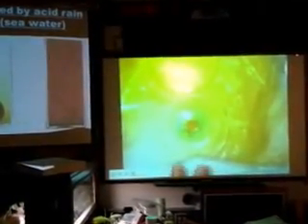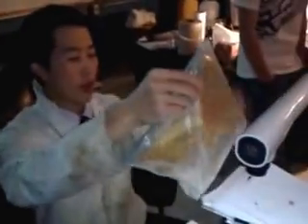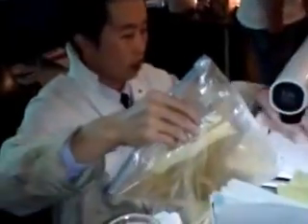Now, let's say if I shook this, okay, you notice I'm going to go like this. So not only do you have this nitrogen thing going on here, but look at the quality of that water. It's now blue. So now some of that copper has become a copper ion. Now you've got blue copper ions in your water. You've got to think about metal contamination and those kinds of things. Okay? And that's the demo for this.